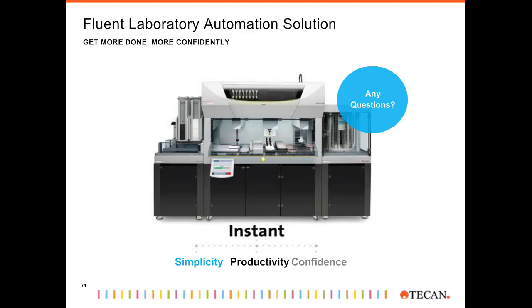All right, it looks like you have a few wonderful questions here from the audience for you, Manuel. Okay. Our first one is, are the cassettes single use only? Yes, they are. I mentioned that during the presentation already.